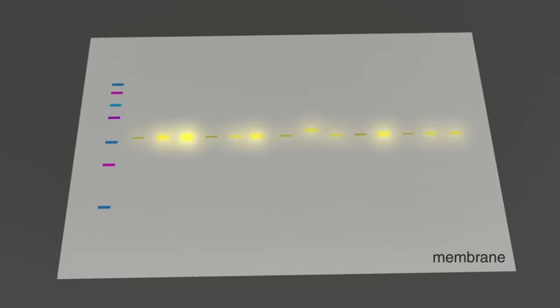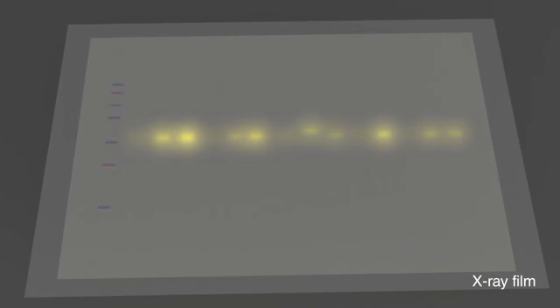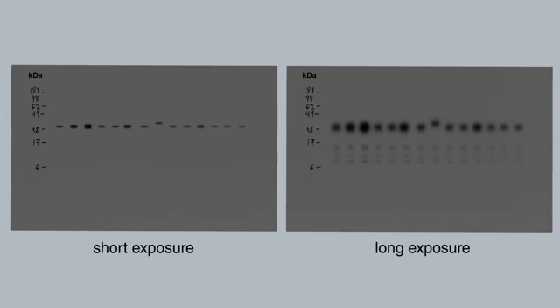The most common way to record light output is using X-ray film. The X-ray film is placed directly on top of the membrane after the addition of the horseradish peroxidase substrate. Increased time exposure of the membrane to the film will yield stronger signals but also increased background.